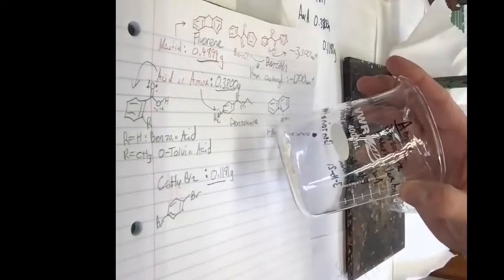Okay, so let's start off. Let's start going. I'm going to initially see if this will dissolve in diethyl ether. Hopefully it will. I put it in the beaker because if it doesn't dissolve in diethyl ether, I'll be able to evaporate it pretty quickly to try another organic solvent like methylene chloride. But I'm hoping I'm right with the diethyl ether.